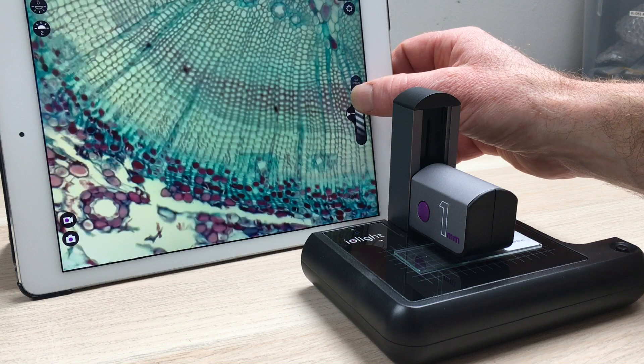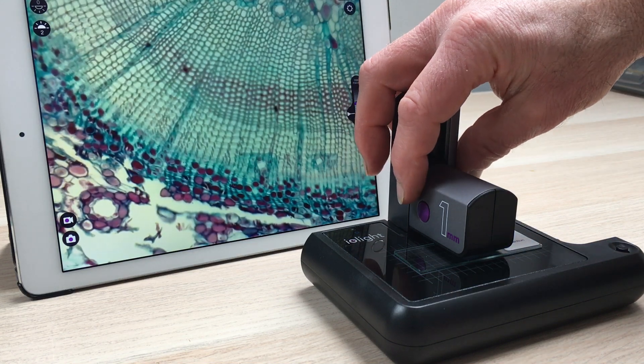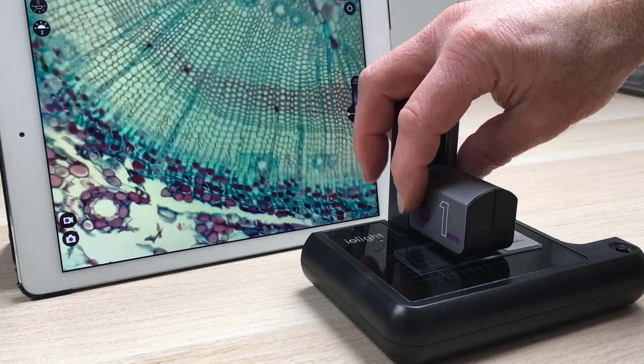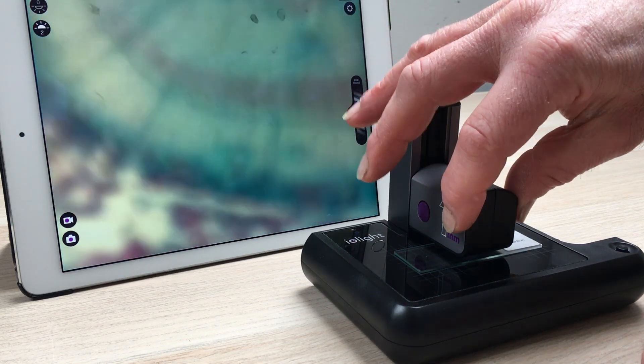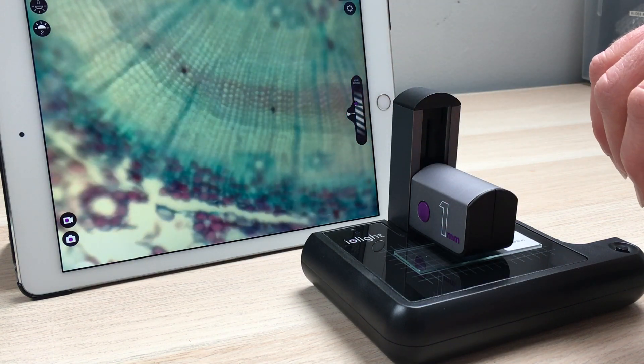The key thing with all these things though is to push the head at the back here, not at the front. If you push it at the front it's very difficult to focus.